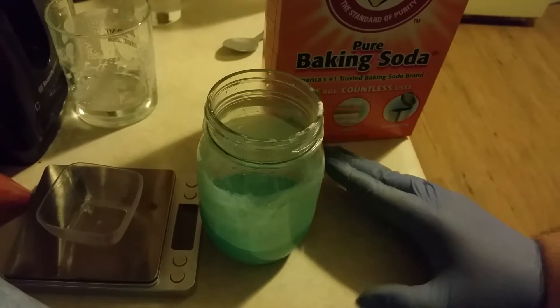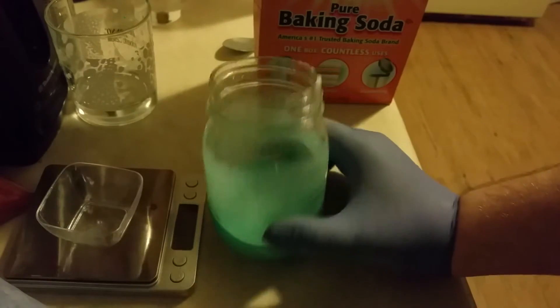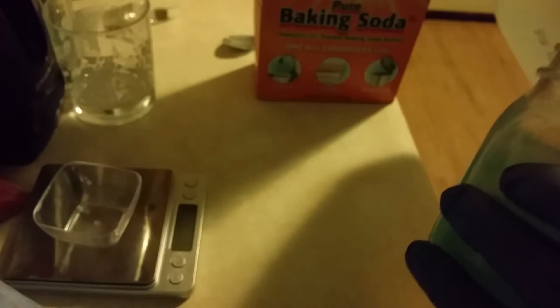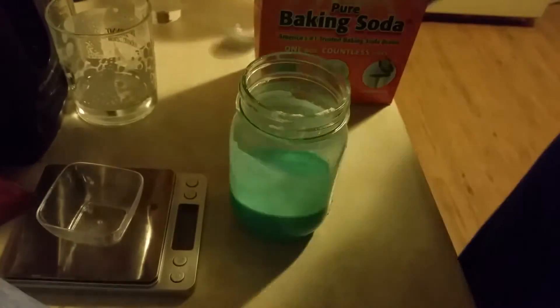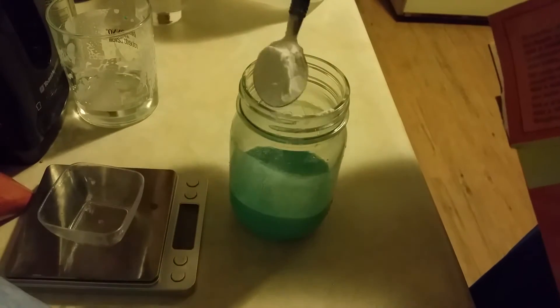Also note that when you add vinegar to the reaction vessel you'll get a lot more foaming and bubbling as CO2 production increases. Any excess sodium bicarb in the solution will be converted into carbon dioxide gas. If you're using a small reaction vessel like I did, it is very unwise to add too much of an excess.